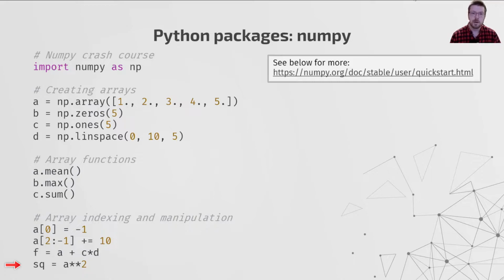Hopefully this gives you an idea of the kinds of things you can do with NumPy and how the syntax is quite logical. We have only just scratched the surface of what is possible. To find out more, please see NumPy's Quick Start Guide at the URL shown here.